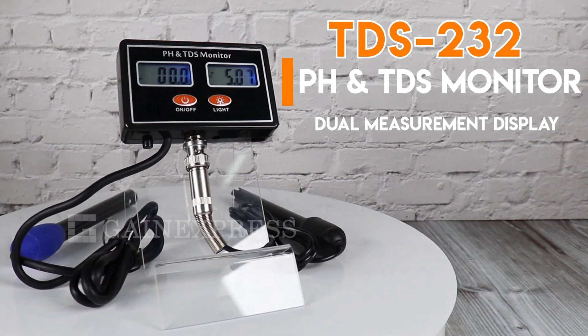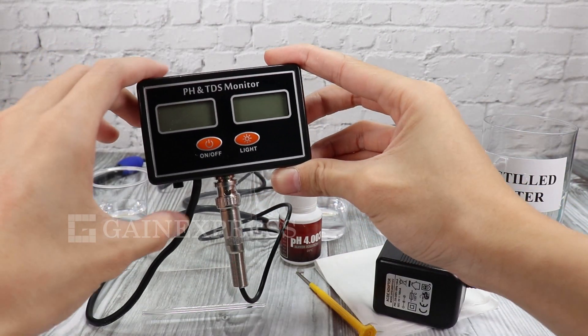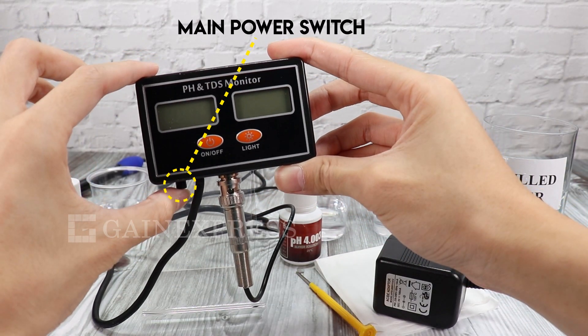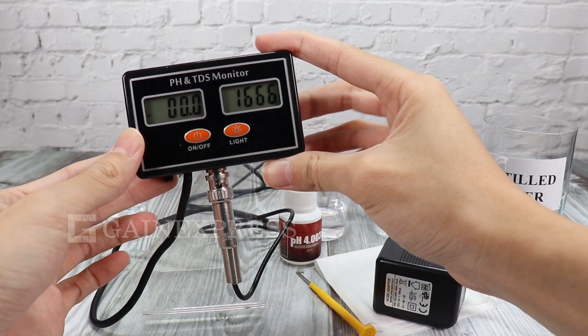TDS 232, a digital pH and TDS monitor with dual display. To operate this meter, press the main switch at the bottom of the meter to open the self-locking switch. You can now use the power button to turn on and off the meter.